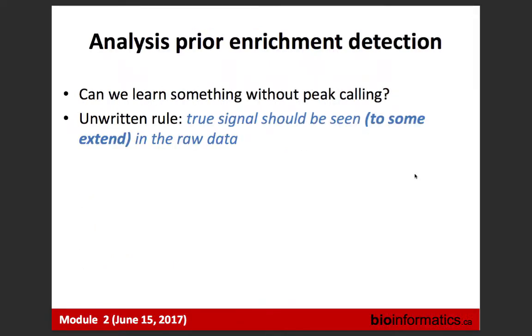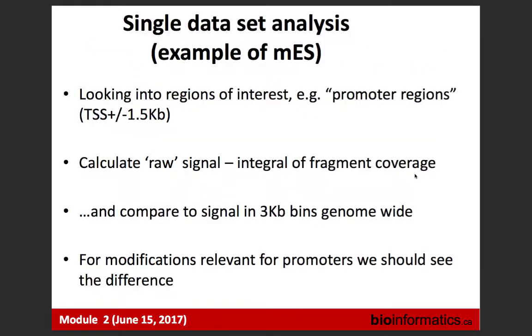Now what I would like to spend the remaining time on is to introduce you to some approaches prior to enrichment detection. What can we do? We can actually learn a lot from the data without doing any peak calling. This will be a single data example, for mouse embryonic cells. We will be looking at regions of interest, and our regions of interest will be promoters of coding genes.